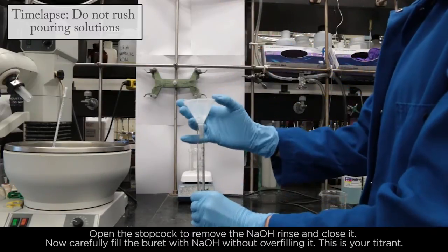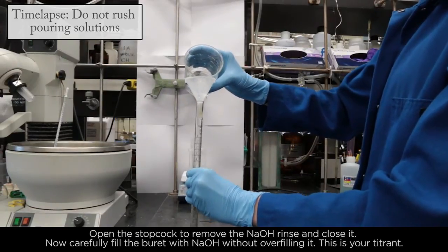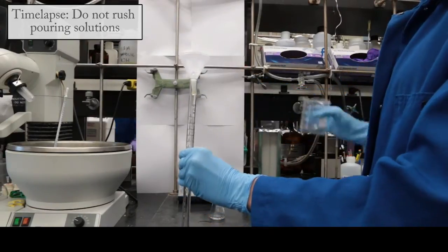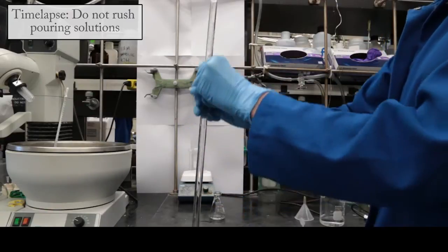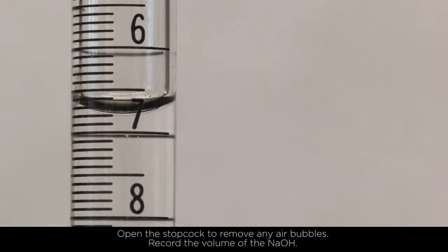Now carefully fill the burette with NaOH without overfilling it. This is your titrant. Open the stopcock to remove any air bubbles. Record the volume of the NaOH.